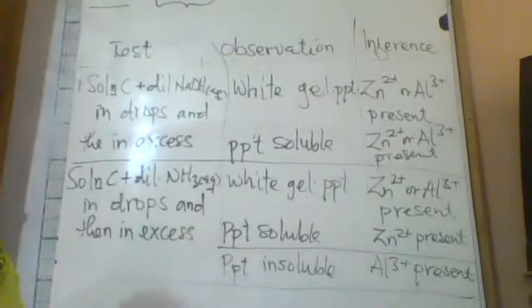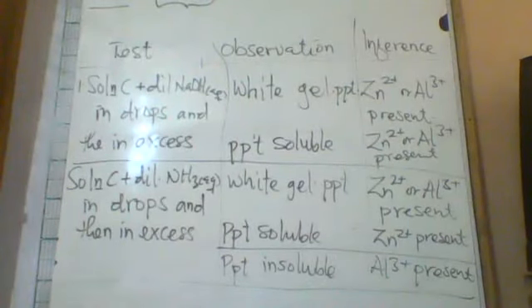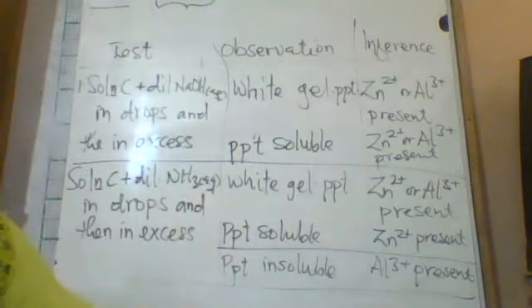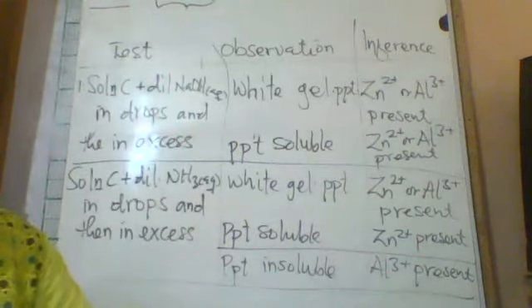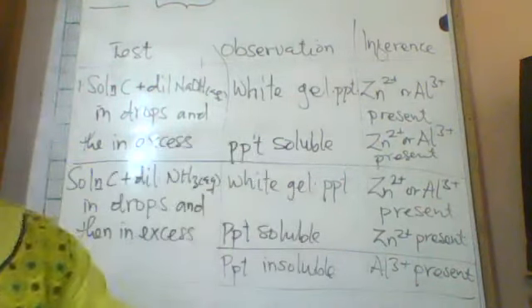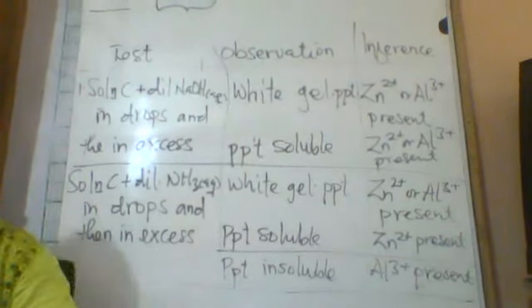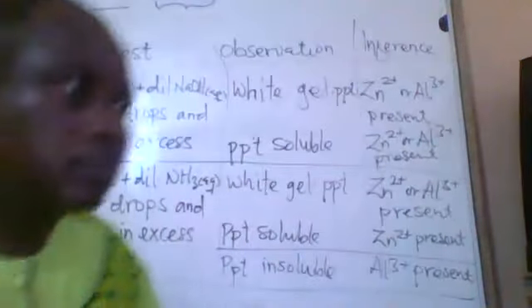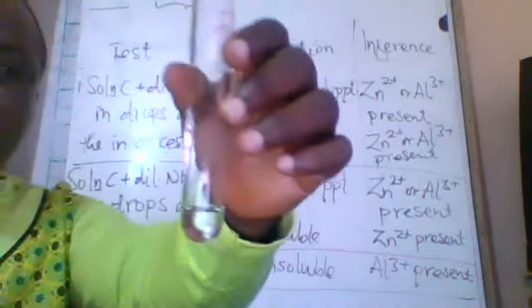Now, let me illustrate that one. I have my test reagent here.